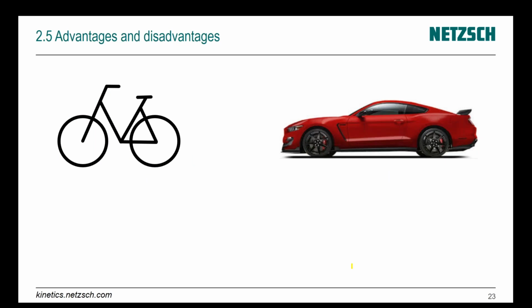Advantages and disadvantages. If you speak about a bicycle, it's easy to learn, easy to use, easy to ride. In Germany, normally children start to ride at 2 years old. But if you have a long distance, then there is a problem. If you have a road with high hills, then it's a problem, and only the power of the body could be applied. Another way is to use the car. The car has an engine and it is power. You don't think about your muscles.